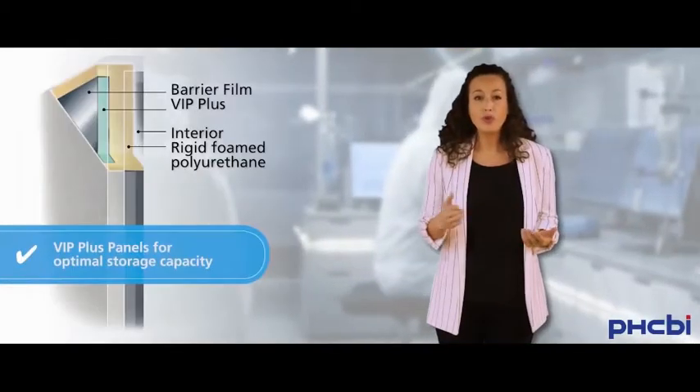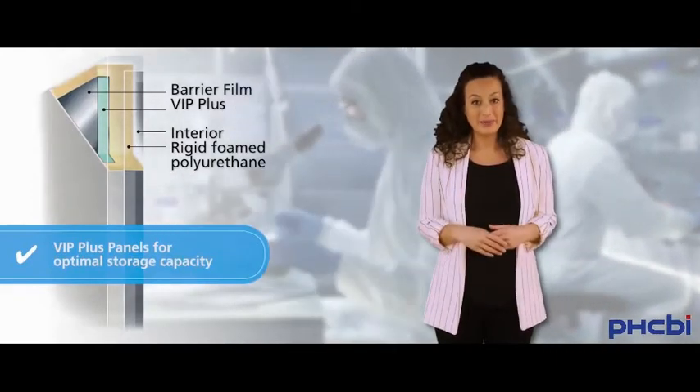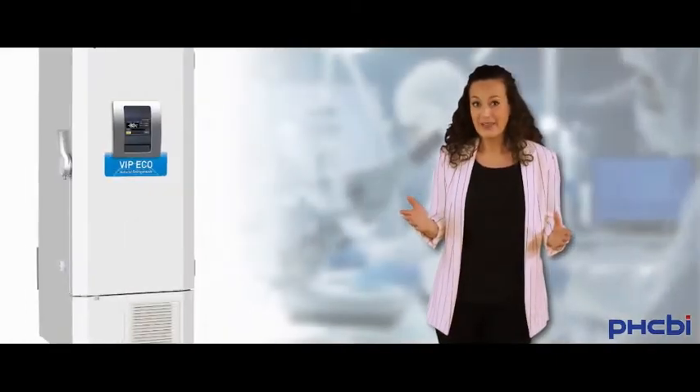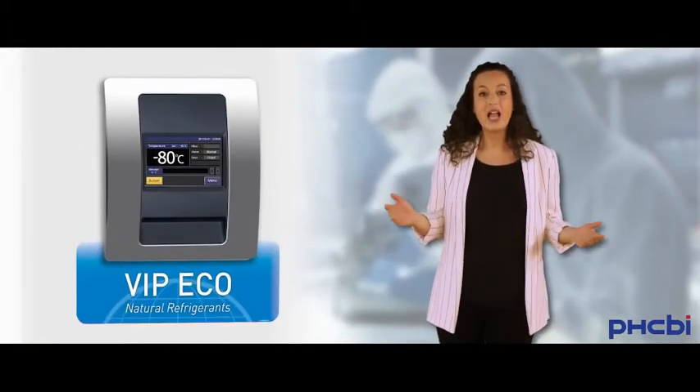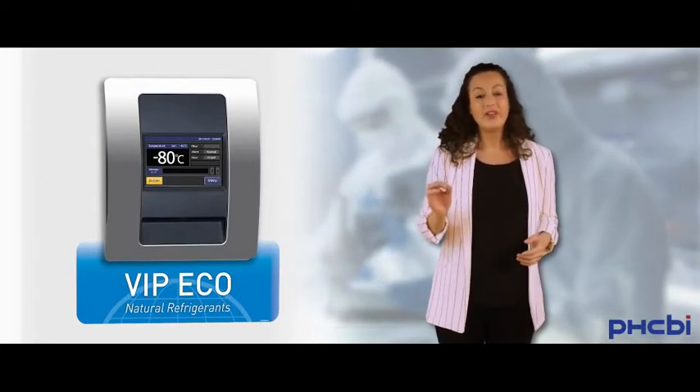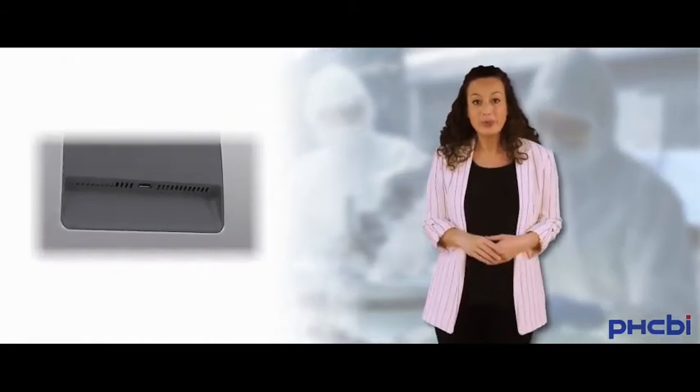It also offers optimal storage capacity through the use of VIP Plus panels. And as you can see, the big display shows all the information you'll need in an instant. Last but not least, you can now also retrieve all data from the unit through this USB port.